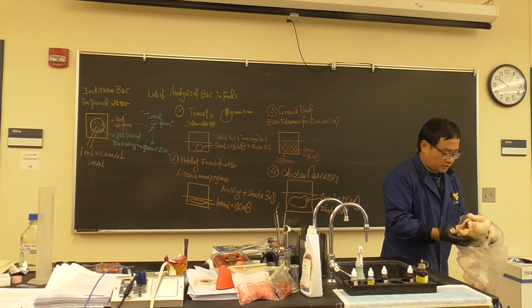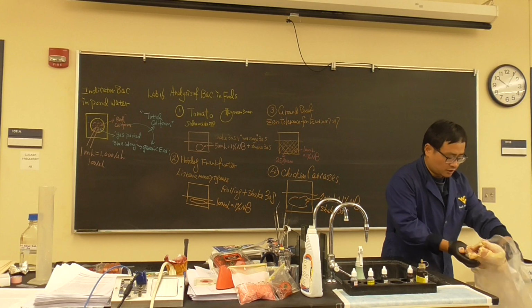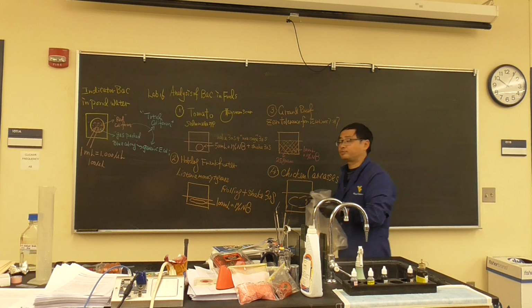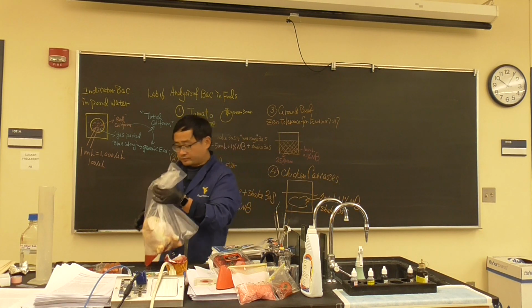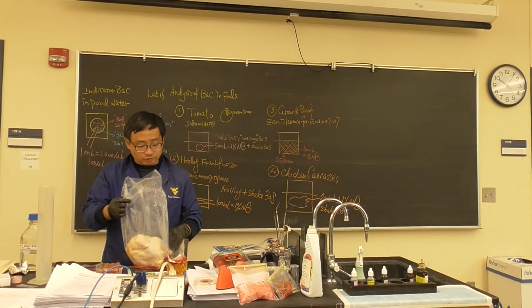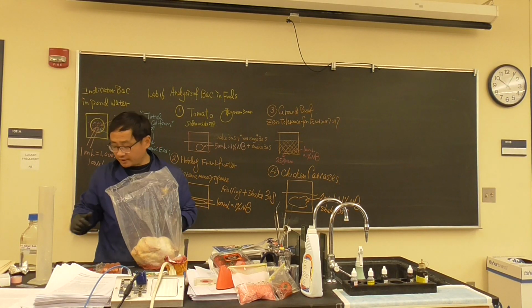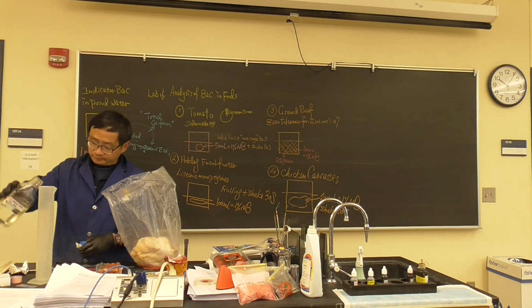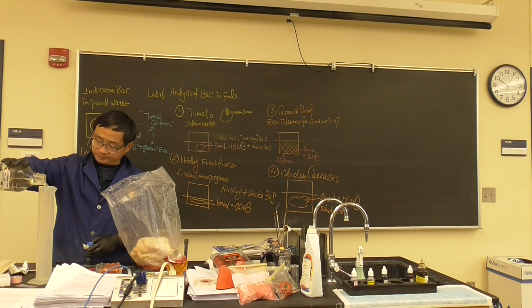This is a commercialized sample with lots of water. But their solution is good because the blood is like our blood agar, the nutrition makes it easy to be the enrichment. When you have this, we add 200 ml.